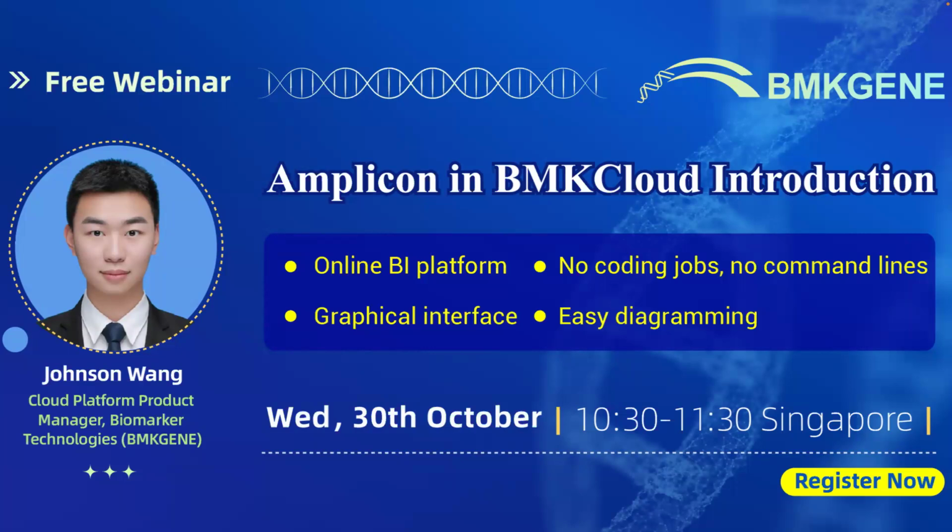In this webinar, we will explore the application of Amplicon sequencing on BMKCloud, a comprehensive bioinformatics platform. The following topics will be covered. Firstly, introduction to BMKCloud. Discover the powerful bioinformatics platform offering a range of tools, applications, and data mining services tailored for microbial research.